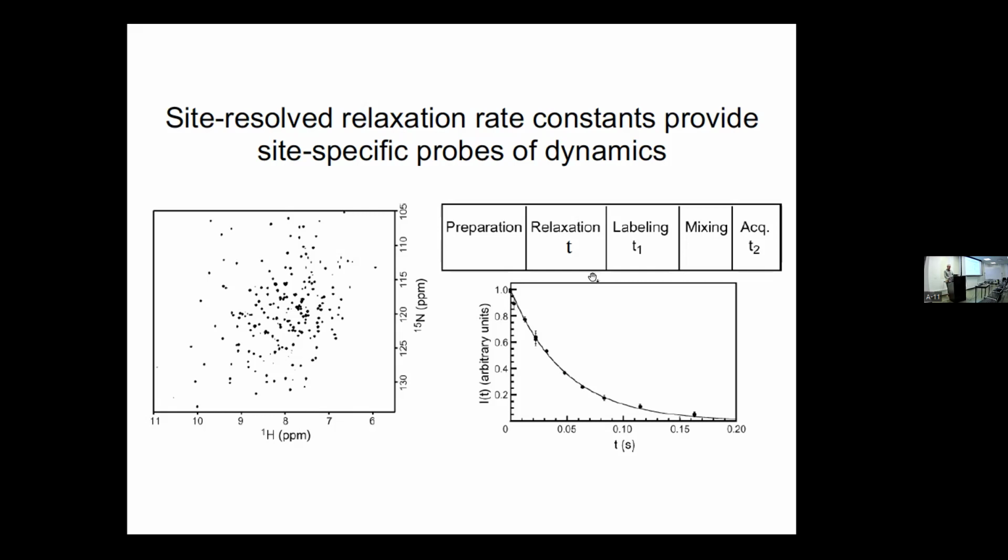He used to tell me that the problem with spectroscopists is they design very complicated pulse sequences in order to get a simple magnetization decay, as opposed to what a theoretician would do, which was have a very simple pulse sequence and a very sophisticated data analysis approach. So perhaps, particularly with machine learning, there will be some changes.